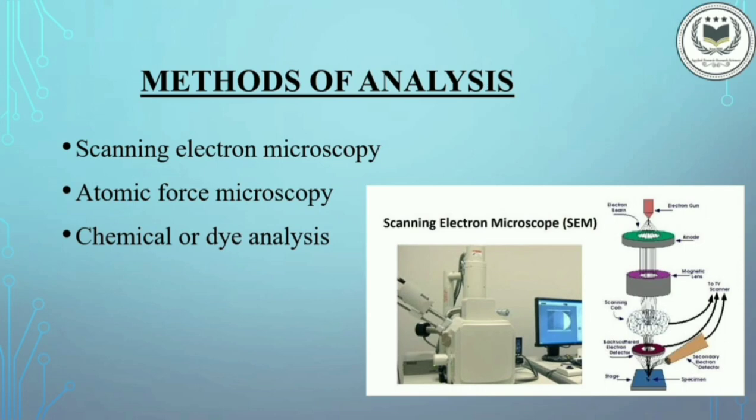There are many advantages of using SEM instead of light as it allows a large amount of sample to be focused at one time. Then atomic force microscopy. It is a method which is carried out using an atomic force microscope. It's an instrument to analyze and characterize samples at the microscopic level. It allows the analyst to look at the surface characteristics with very accurate resolution.